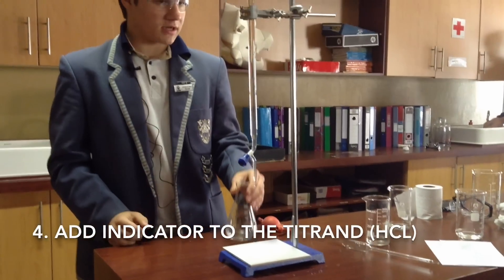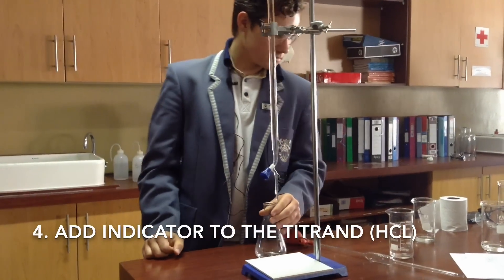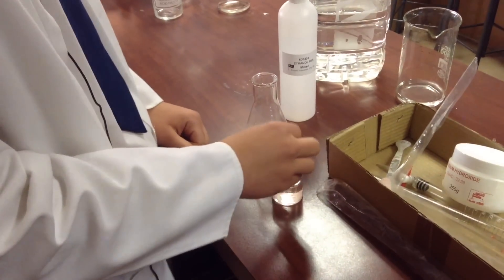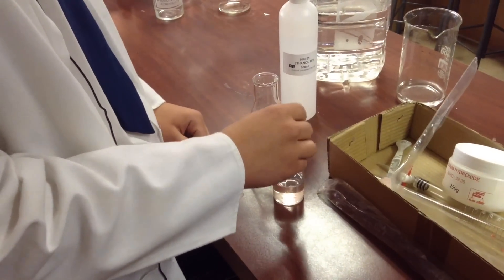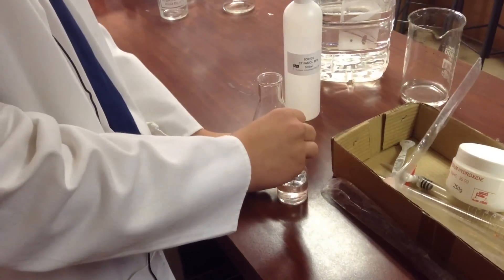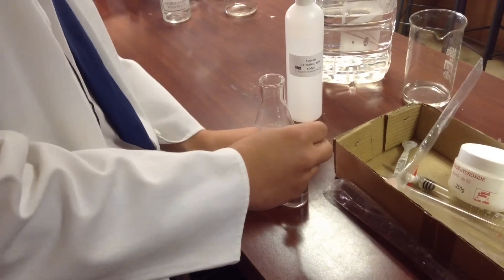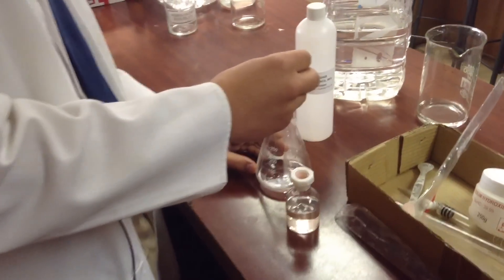Okay, now we're going to need some indicator. For our indicator we're using phenolphthalein, so we're going to use the dropper and we're going to put in three drops of our indicator into our HCl.